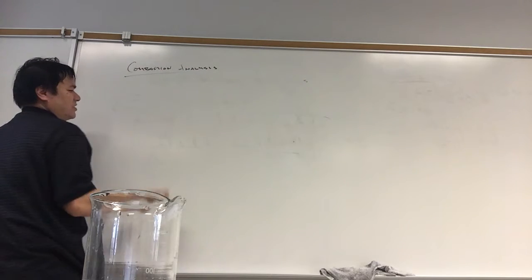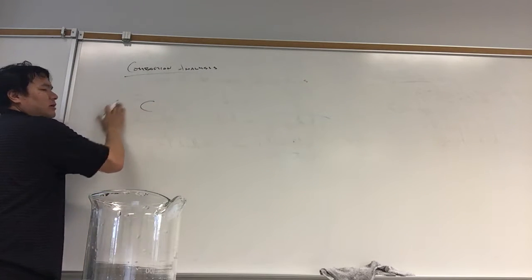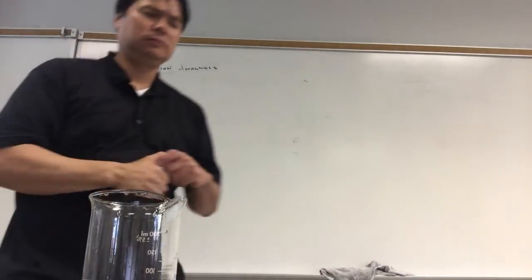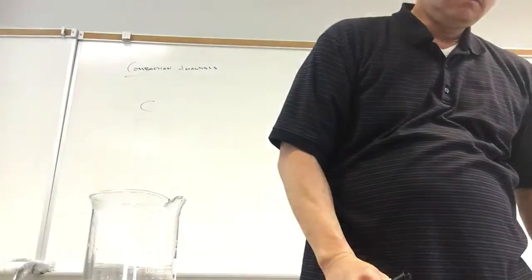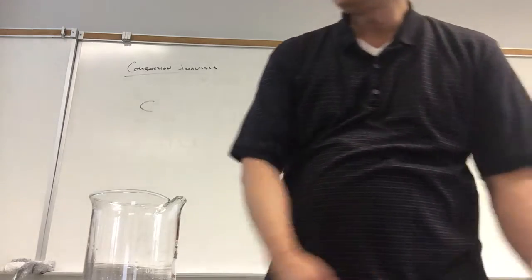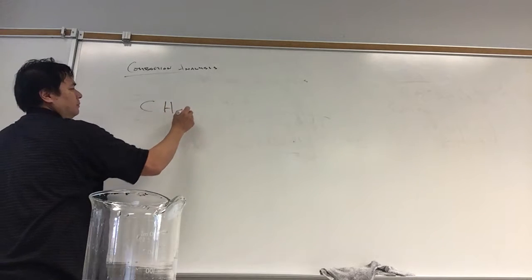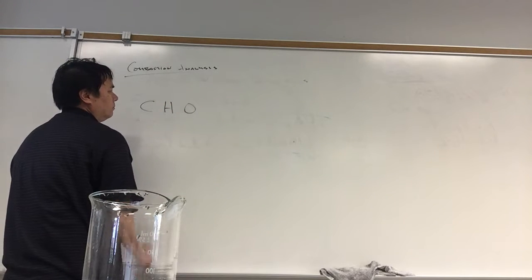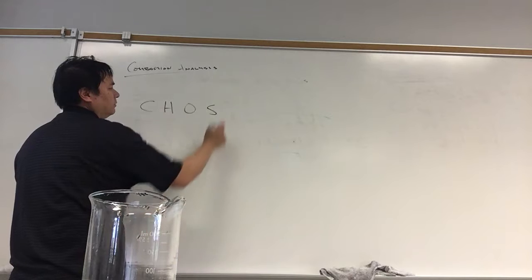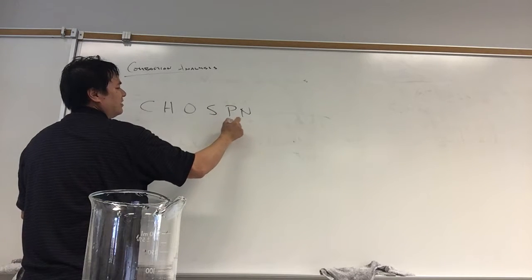So combustion analysis, we just burn the sample. And the sample, you know, it's organic. So organics contain carbon, what? Carbon and hydrogen for sure. And then the next most common would be carbon, hydrogen, oxygen, sulfur, phosphorus, nitrogen, etc.